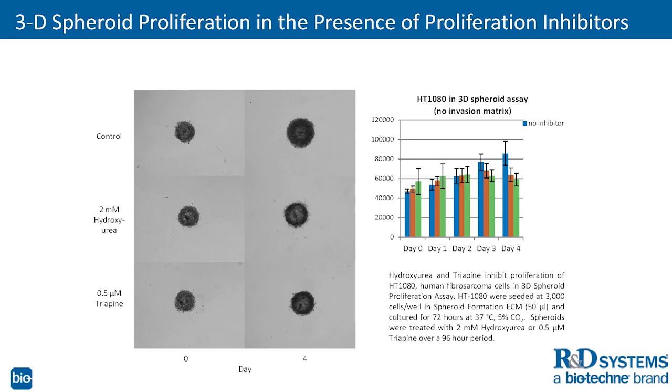I apologize, the bottom of the figures got messed up when we uploaded them, but it's day 0 on the left and day 4 on the right. And we see virtually no growth over the 4-day period with these inhibitory compounds.